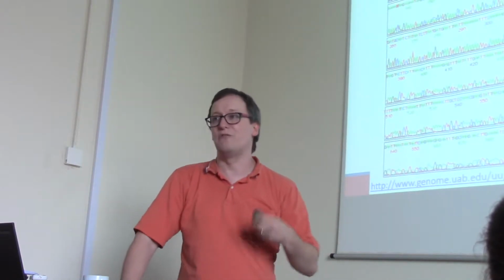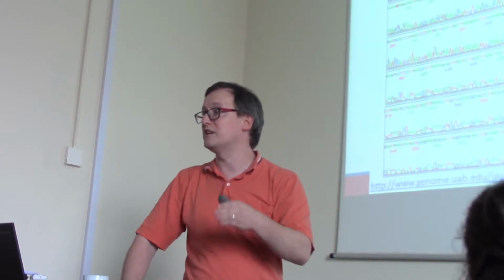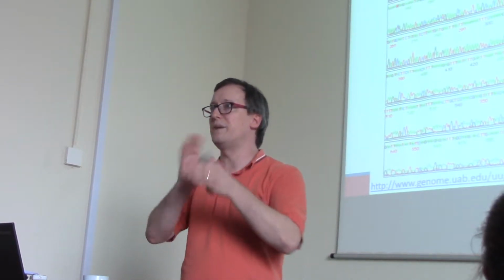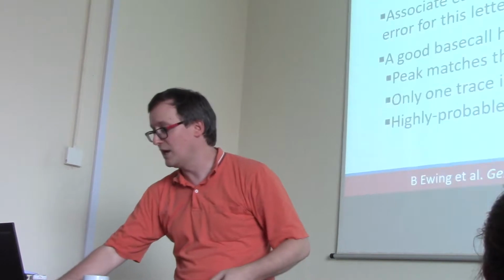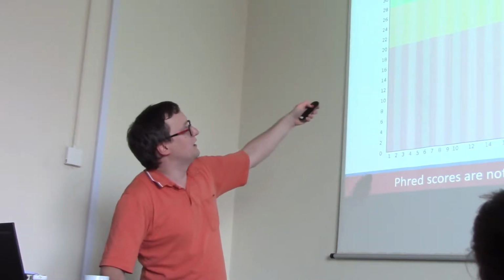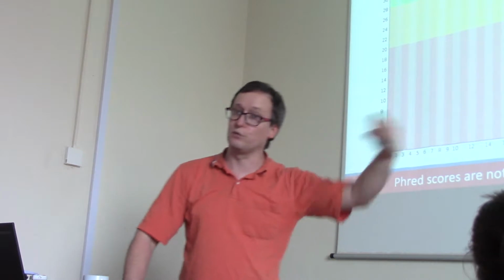That principle is not really that different from capillary electrophoresis to today's massively parallel sequencers. We still see that our ability to distinguish base calls as we get further and further into the sequence diminishes. And you can see that in the FASTQC report here. We see that the minimum values that we're seeing are starting to sag as we get further and further through the sequence read.